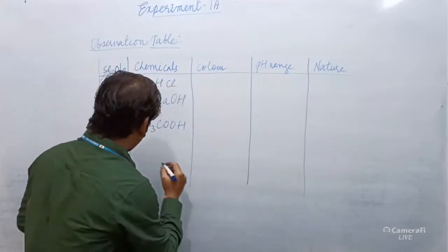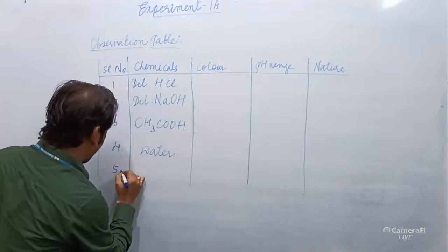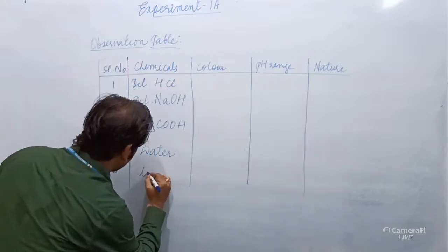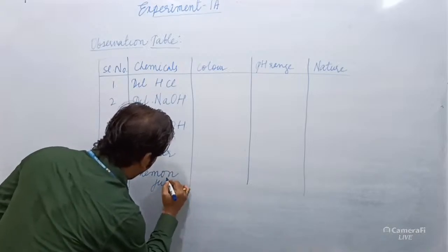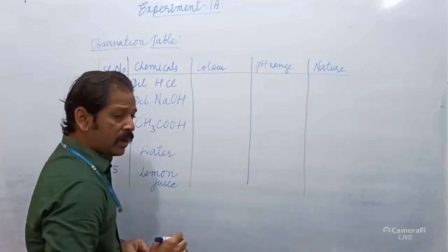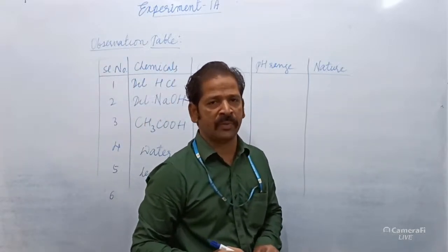Fourth is water. Fifth is lemon juice. The last chemical is sodium bicarbonate solution.